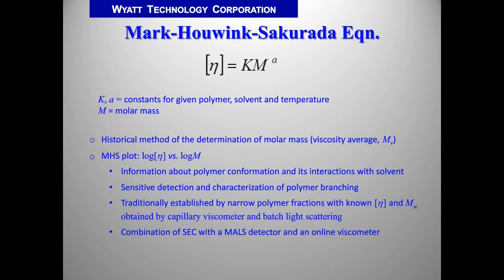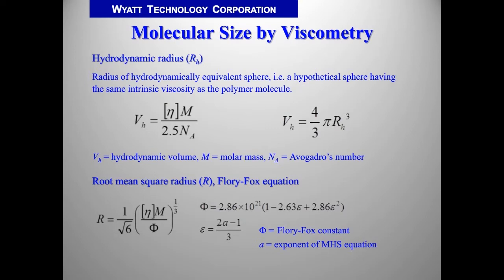So using SEC, its online MALS and online viscometry, we can get the Mark-Houwink-Sakurada plot for one sample in less than 1 hour. Another application of intrinsic viscosity is the measurement of molecular size. It is, first of all, hydrodynamic radius.